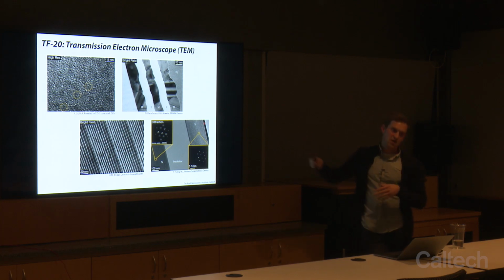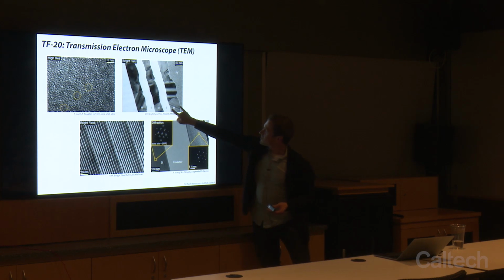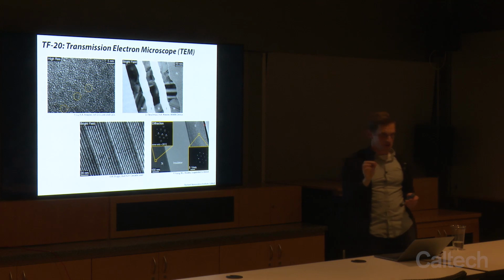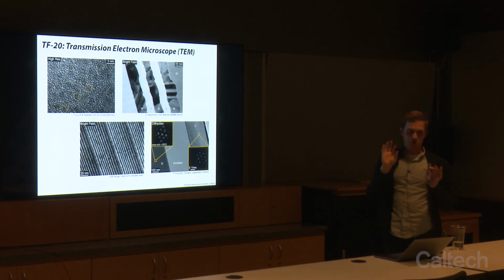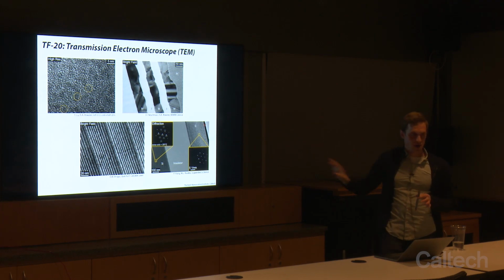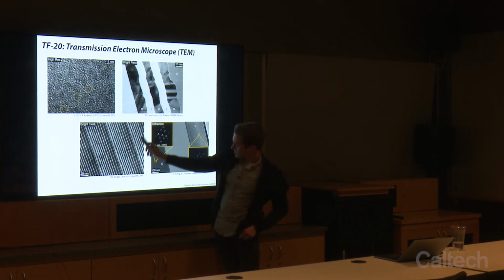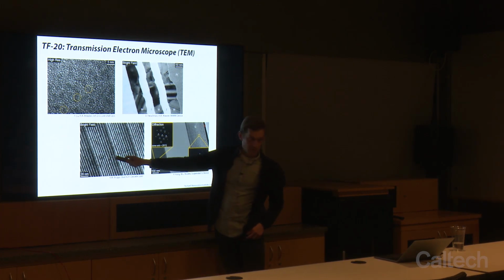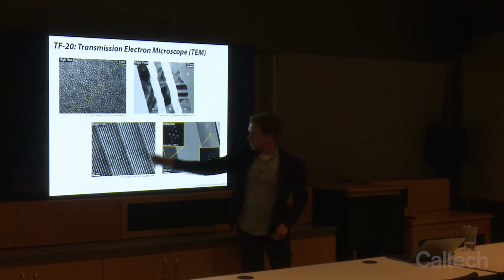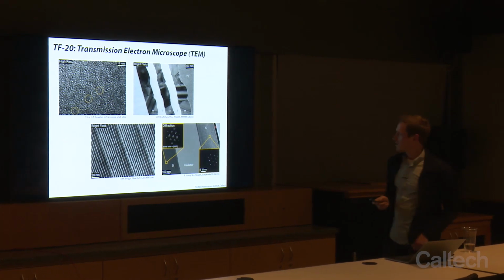This is not information that's readily available in an SEM, especially at 50, 60 nanometers, about the thinnest we can do in an SEM in cross-section. We've seen 10 nanometers, but you're not going to get that kind of contrast with grain boundaries and twin boundaries. This is a quantum cascade laser, so molecular beam epitaxy of all these different layers as small as 1 nanometer. Here we're seeing in cross-section what that quantum cascade layer looks like in the TEM.